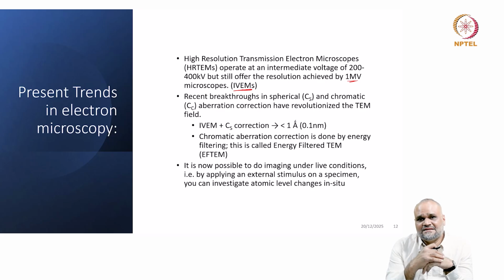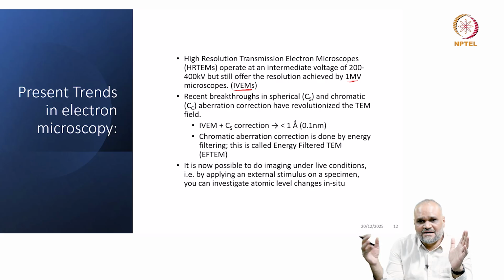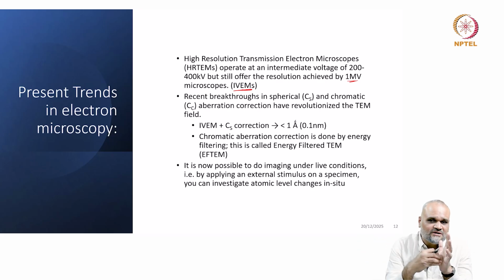There is some effort being made to integrate multiple tools together. That is, along with an electron column, people are trying to get an atom probe column into the microscope as well. This is being done again at Forschungszentrum Jülich and at Rouen. So there is effort going in a direction where you are bringing two different techniques together.